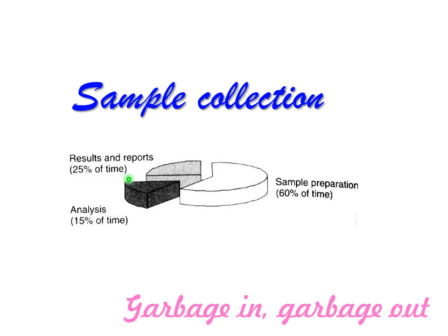Despite that, most of the attention in all publications and textbooks you can find is dedicated towards analysis, while if you do something wrong with sample collection or sample preparation, your analysis is useless. The garbage in, garbage out rule works perfectly well in this case.